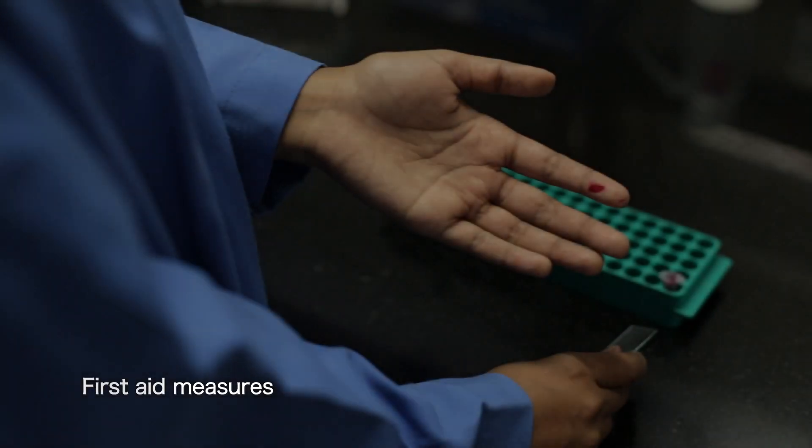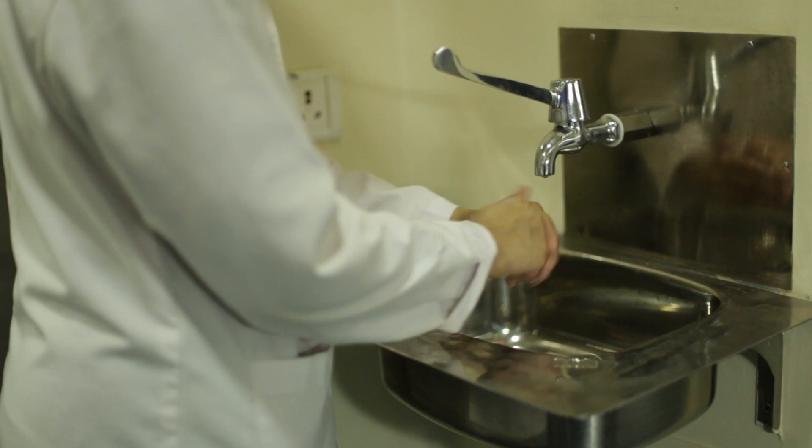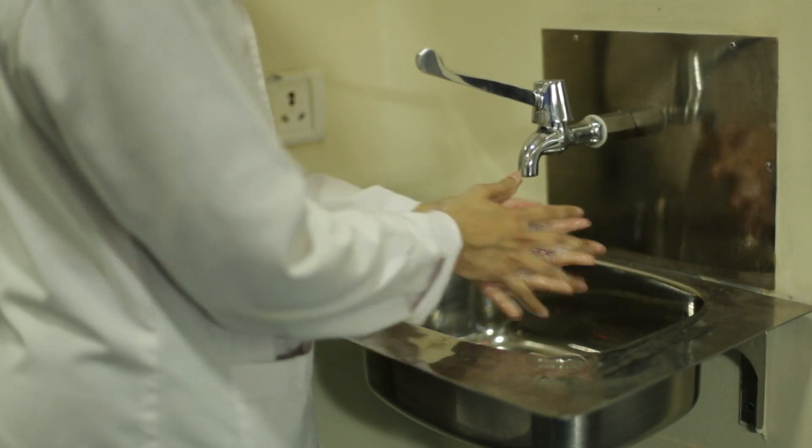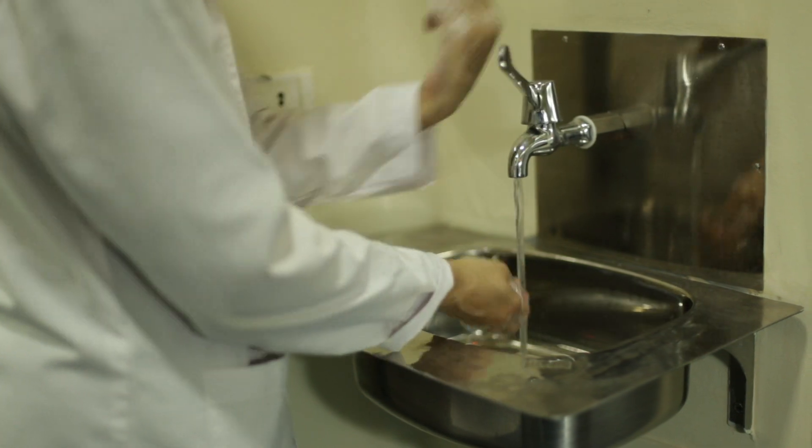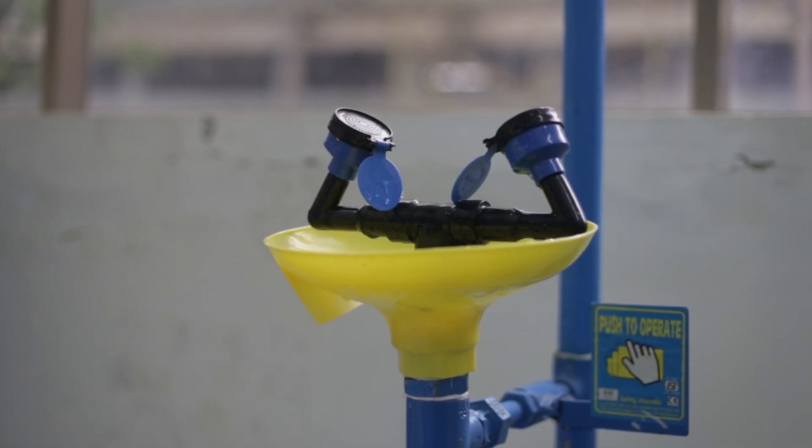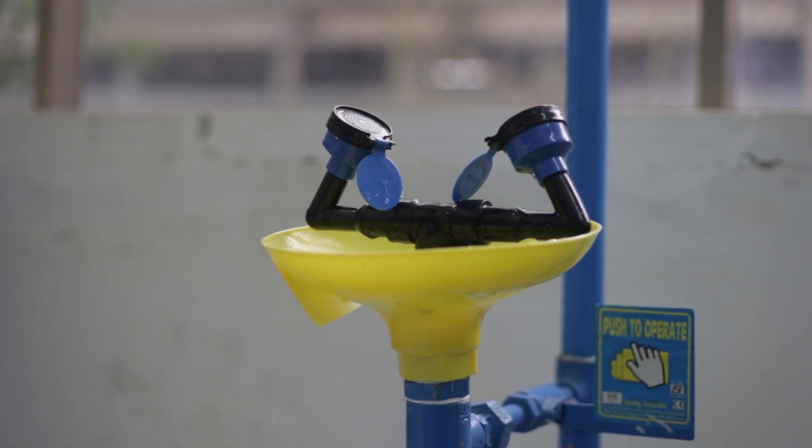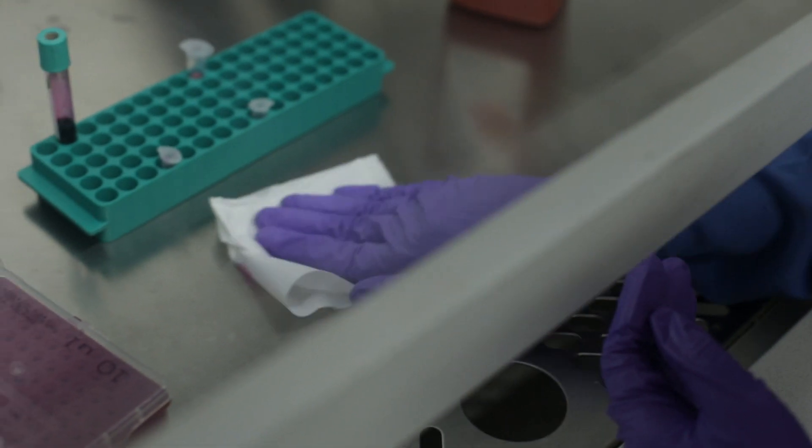In case of injury from any contaminated items, wash the area with soap and water. Report the injury to the principal investigator and to the medical officer immediately. In case of splashes to the eyes, flush the eyes continuously with water. Be prepared for dealing with spills. This can happen inside the biosafety cabinet or outside the cabinet.